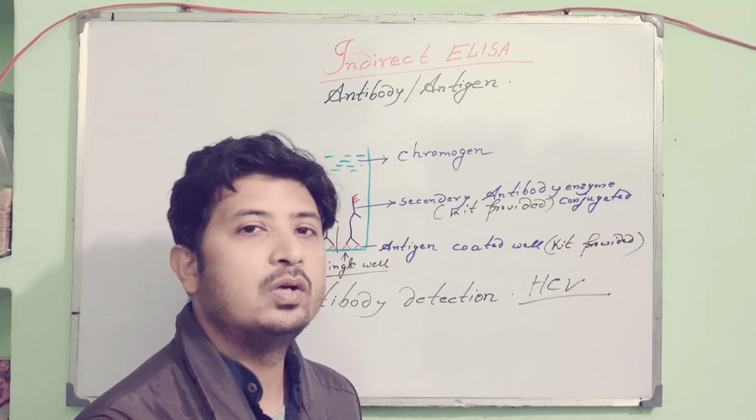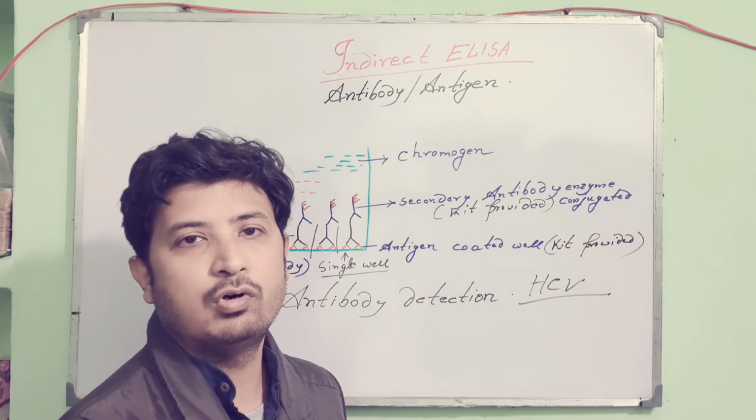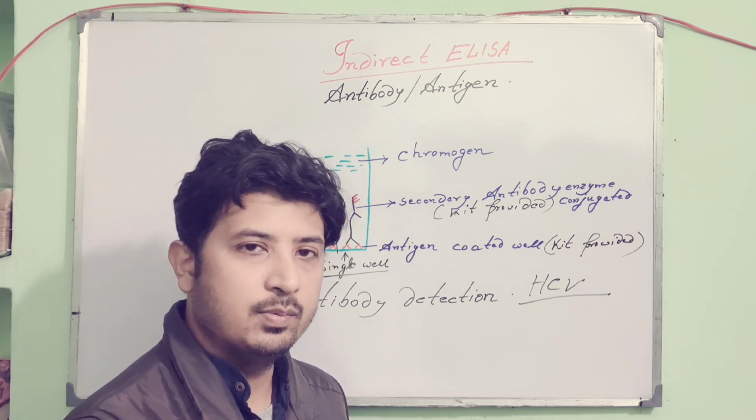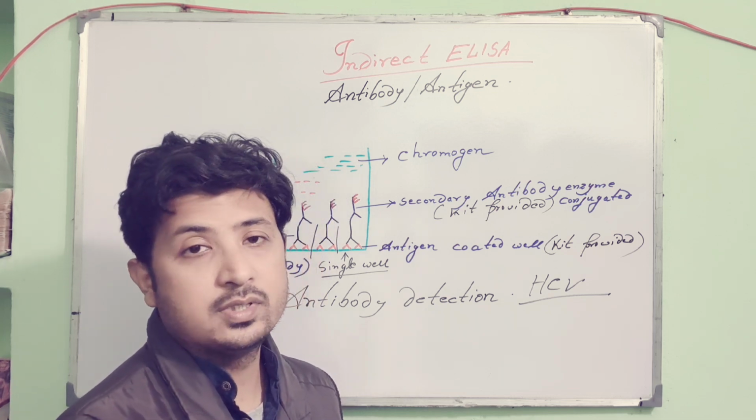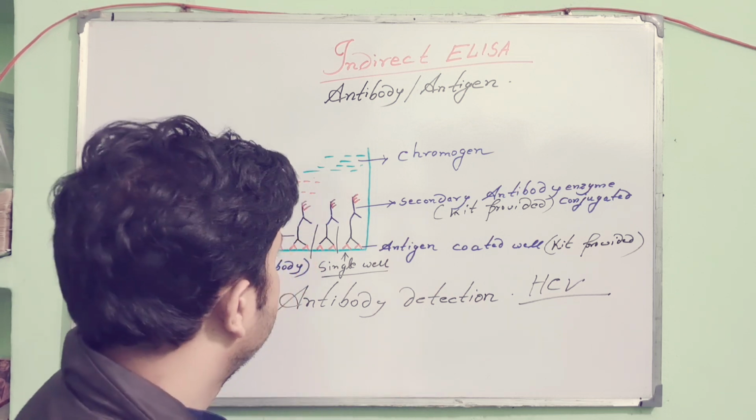Last day I told you that washing is a very important step. It should be done very carefully, otherwise it will give you false positive and false negative results. For your ease, if you have not seen my previous video, go to the previous video. I will give the link in the i button.